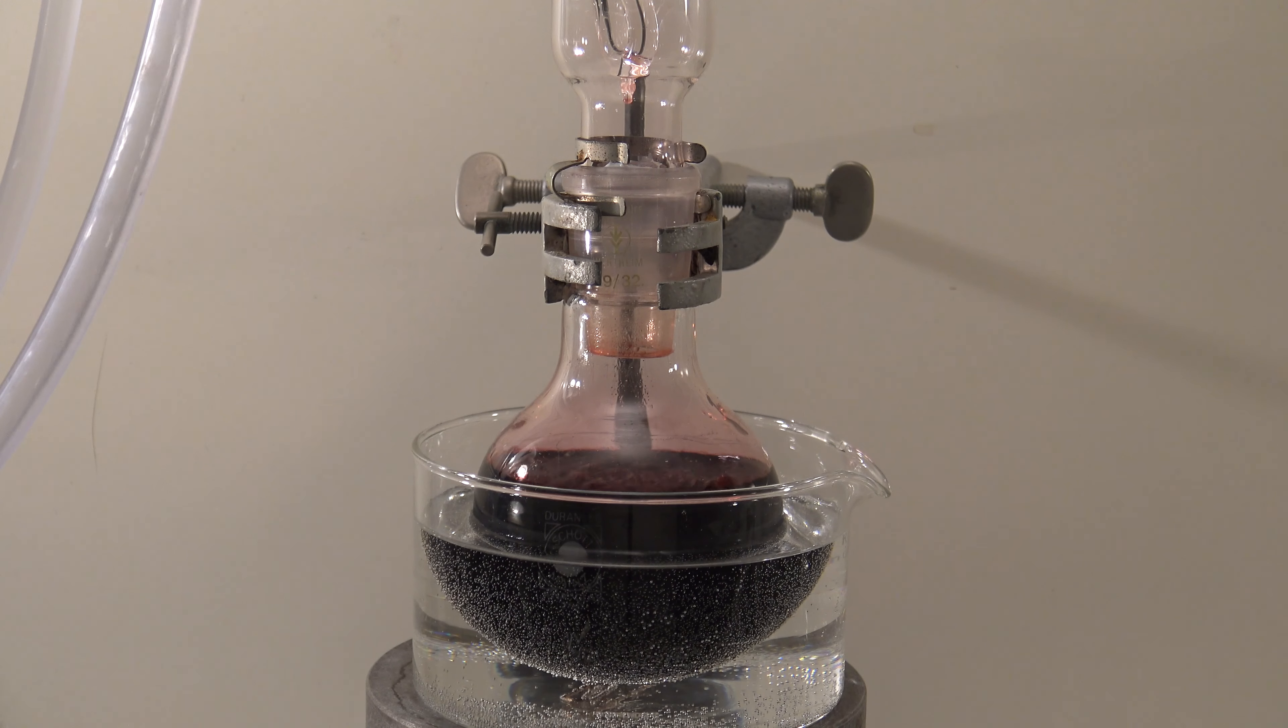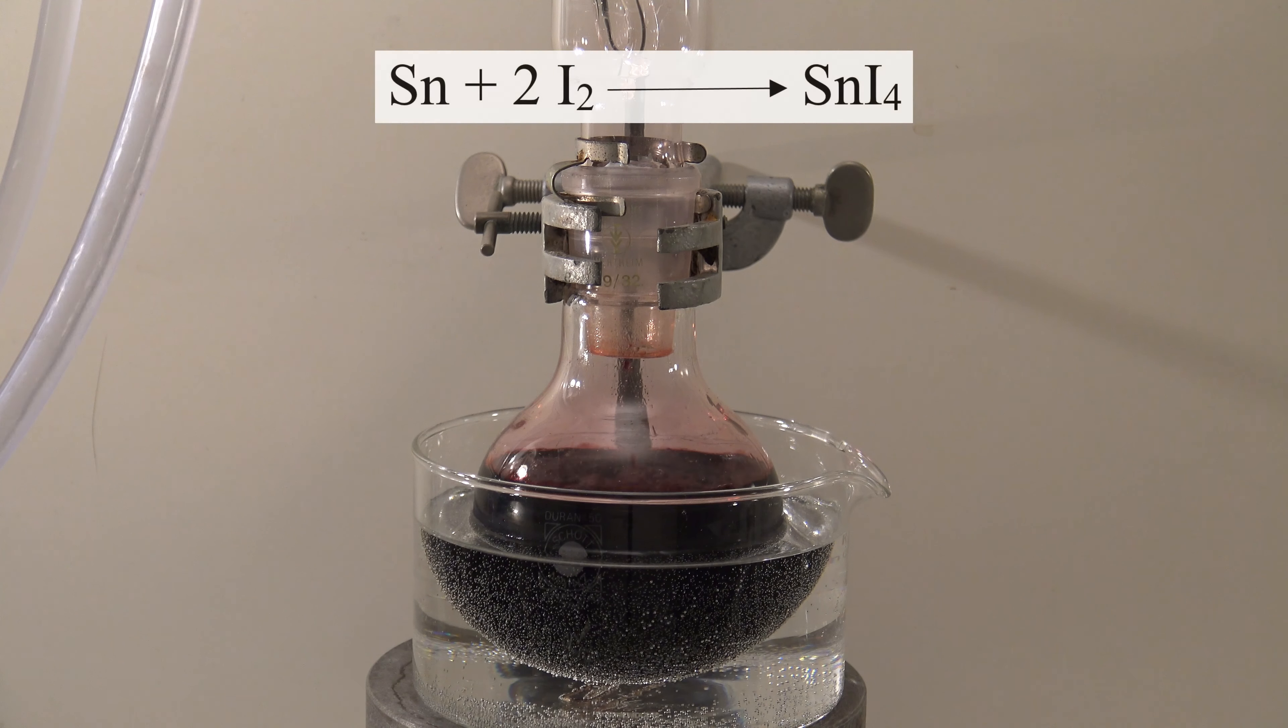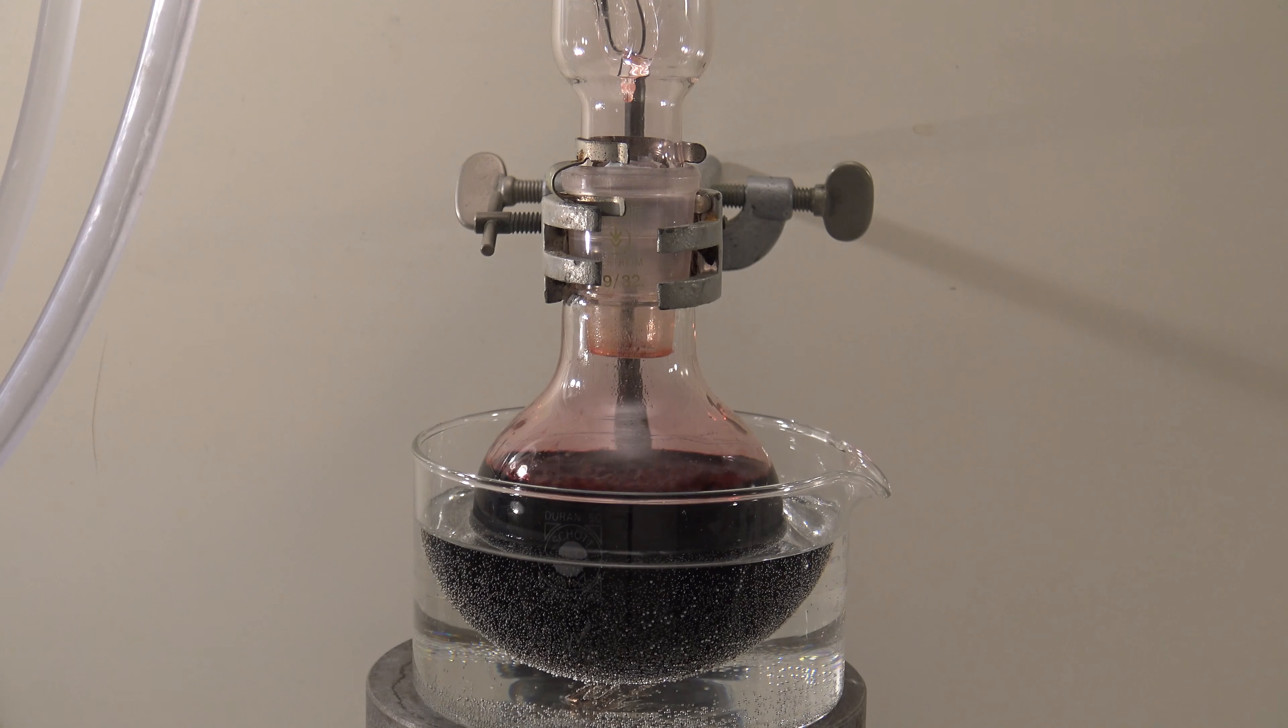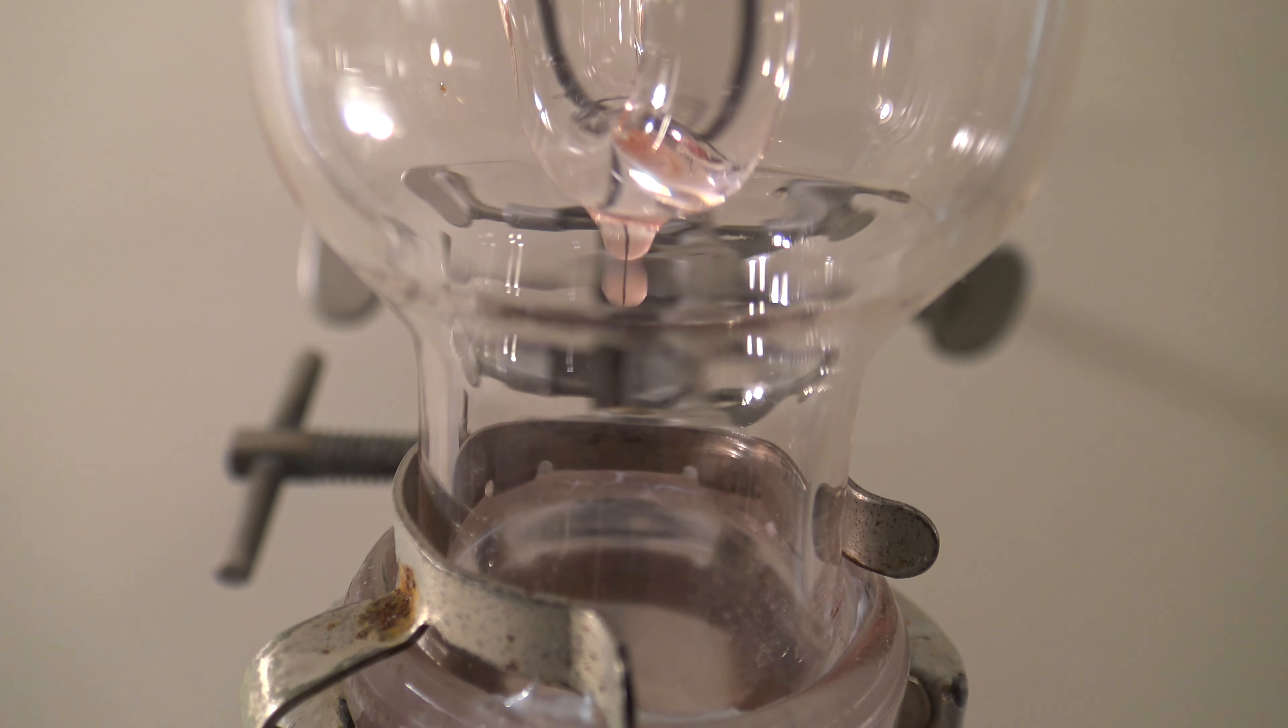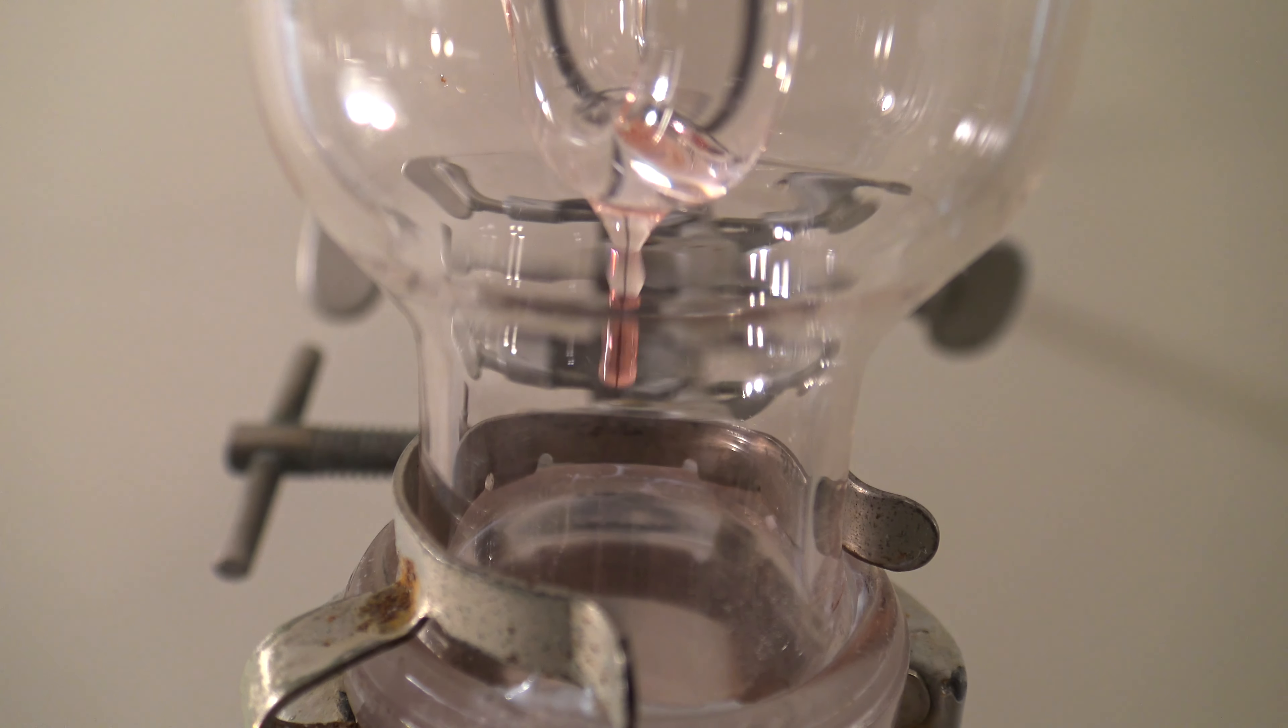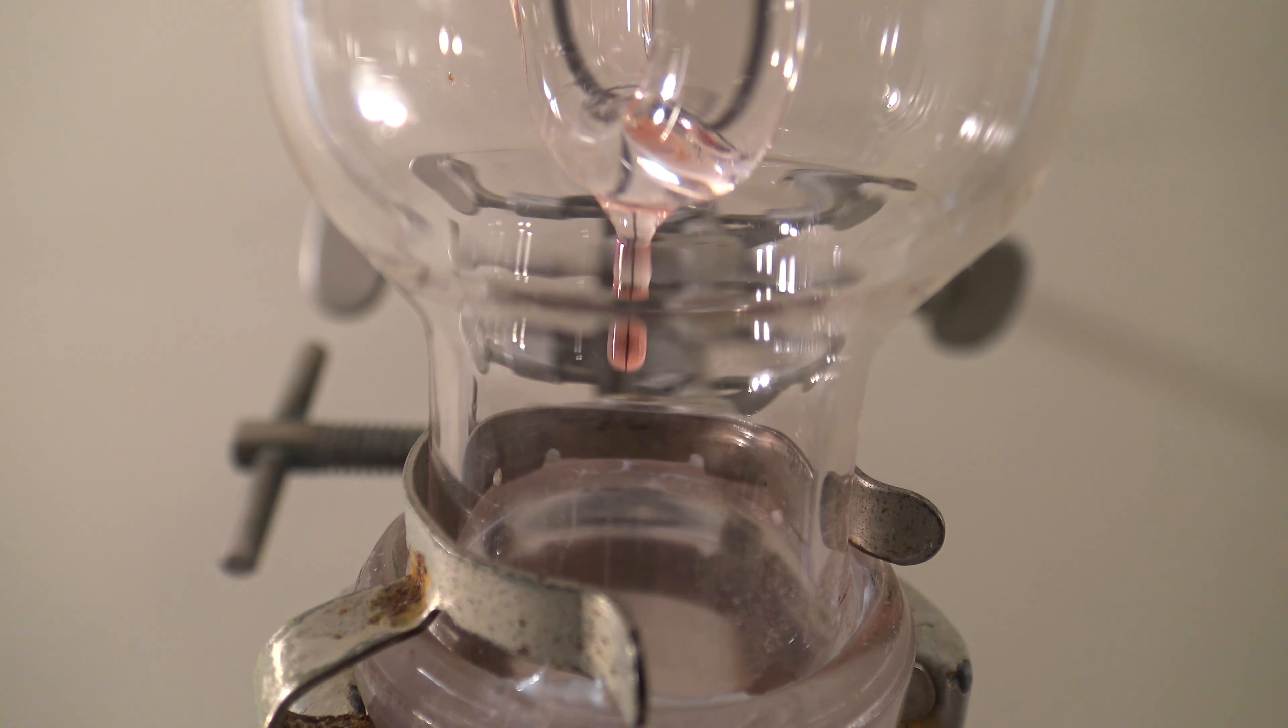The following simple reaction takes place: tin and iodine react to form tin(IV) iodide. The dichloromethane acts as a solvent for the iodine and the tin iodide. Nevertheless, other solvents like chloroform, ethyl acetate, or toluene could also be used. The reaction should be finished after about 40 minutes when no iodine is present in the cooler anymore.